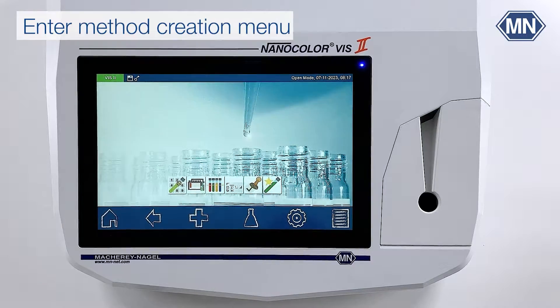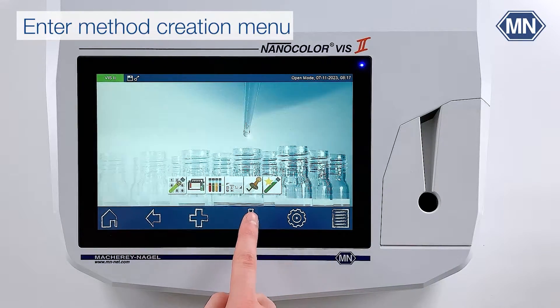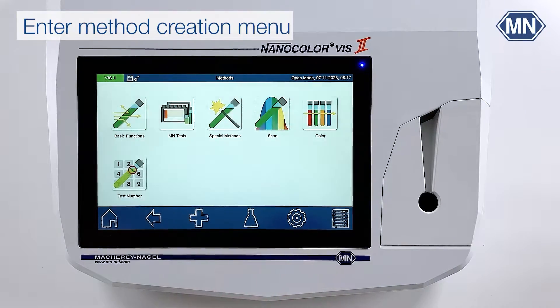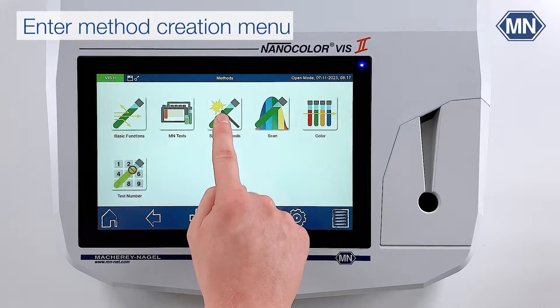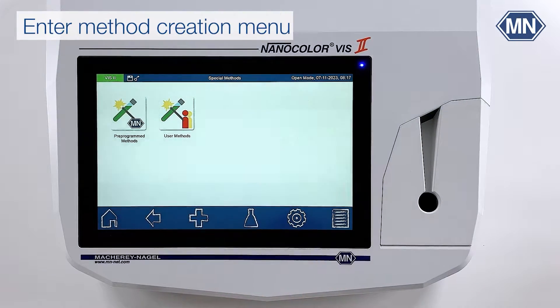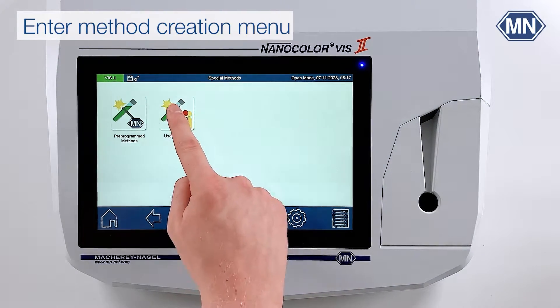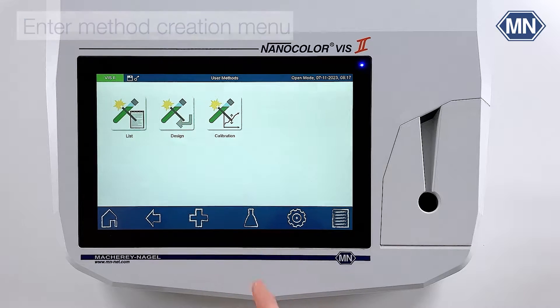To enter the method creation menu, press the Erlenmeyer flask icon in the bottom taskbar. Then click on special methods and enter the user methods.